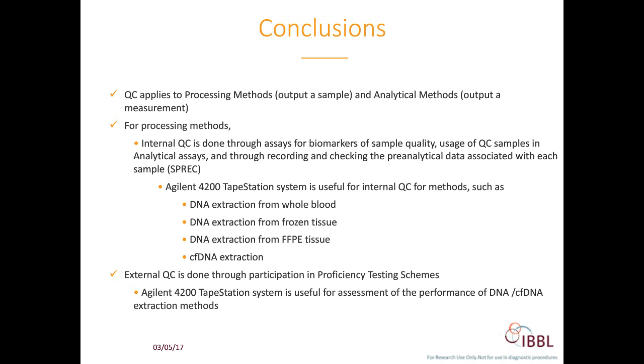Agilent 4200 TapeStation system is useful for internal quality control for methods such as DNA extraction from whole blood, from frozen tissue, from FFPE tissue, and also cfDNA extraction.